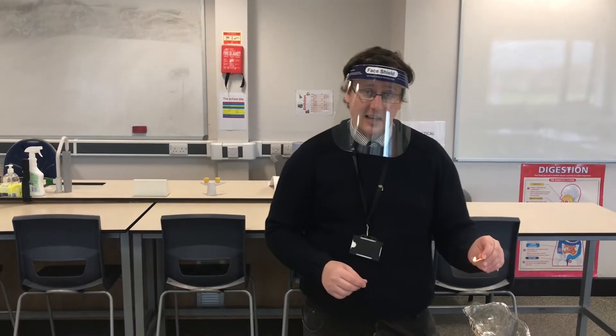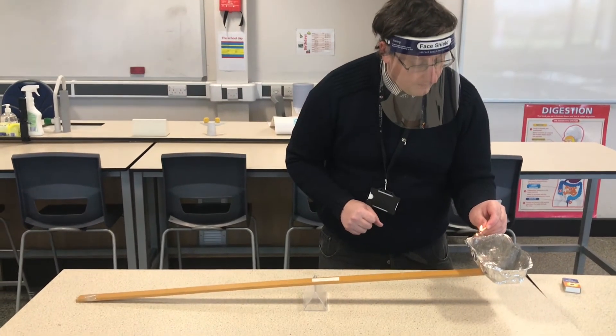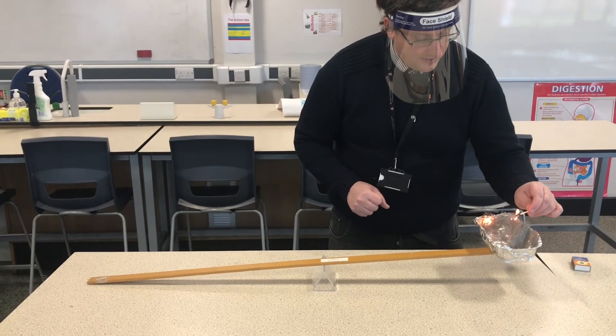Okay, I'm now going to light the iron. You should have written down what you think is going to happen. Be very careful not to touch it, but go just close enough to actually light this iron wool.